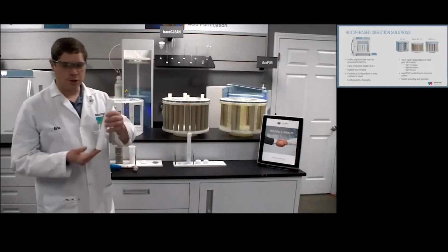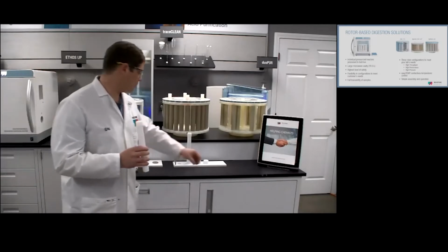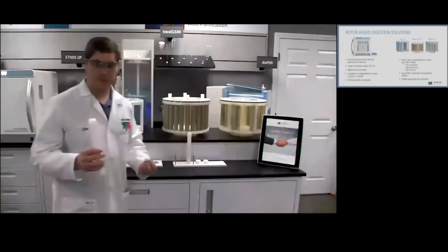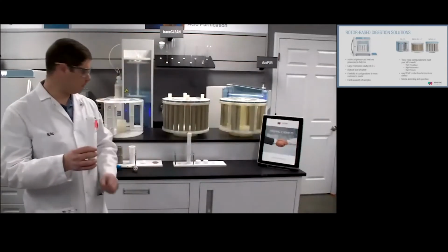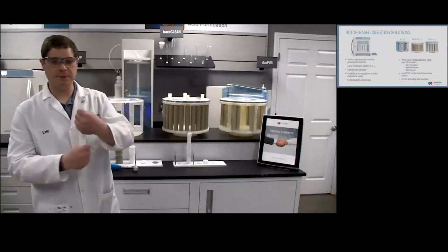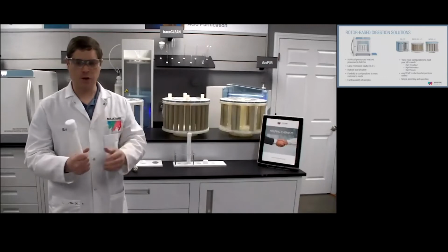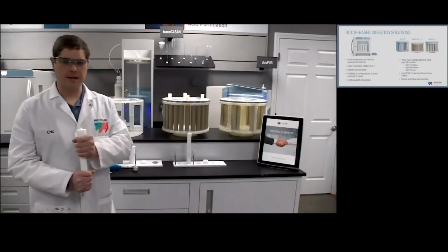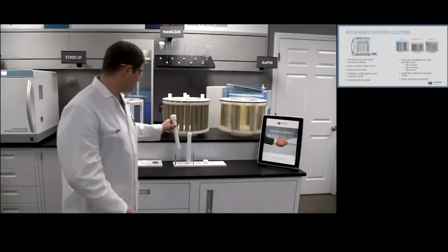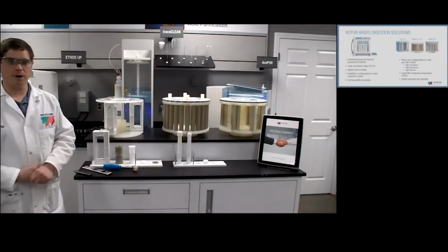The vessel construction is quite simple. You have an 80 milliliter TFM vessel. It can be placed right on the analytical balance, and I'm going to show that to you. You have a top that goes on top, and then you have a cover. And then simple hand tightening is all you need to do. There's no torque wrenches required. That's all the tightening that's needed for that. So this will work for pretty much any of the nutraceutical samples that you're going to be working with.